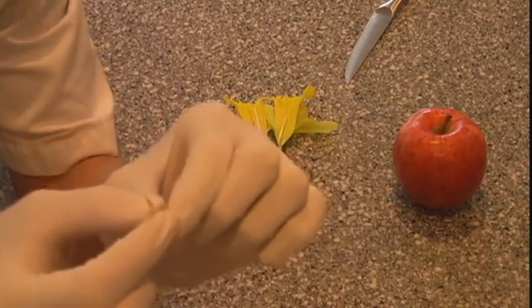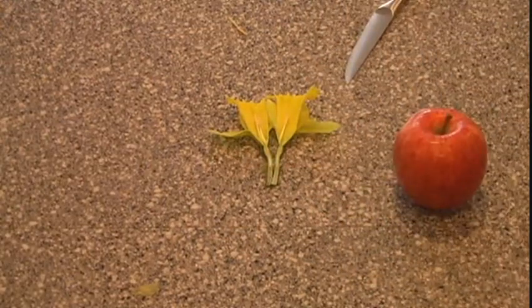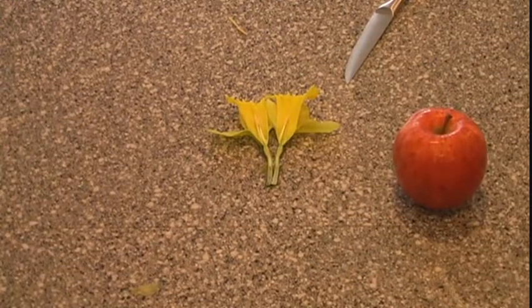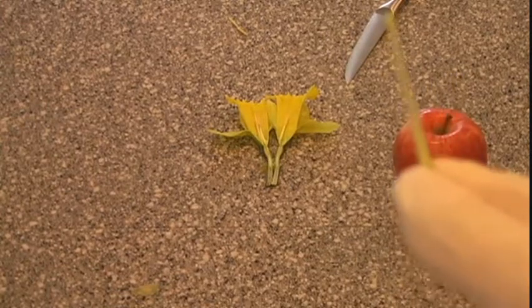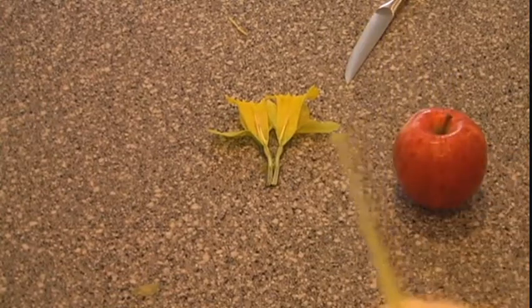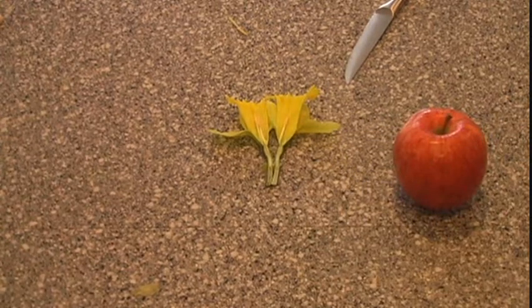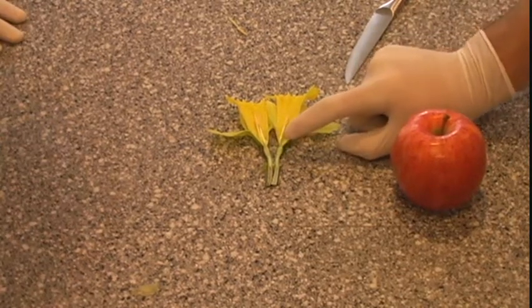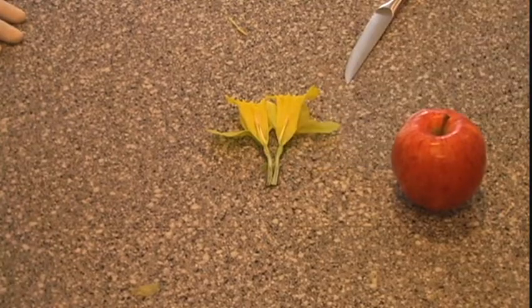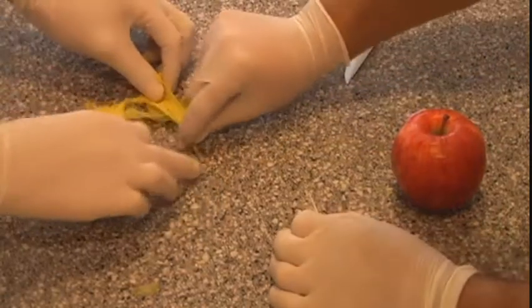Moving on to the female body part, which I will take over for. We have right here what is known as the stigma. And the stigma is incredible, really, because it is where the plant gets fertilized. And if we were to cut this up, which we will very soon, and get you really into the deep depths of the flower, we can see where the ovaries and the ovules are. So let's show those up first.